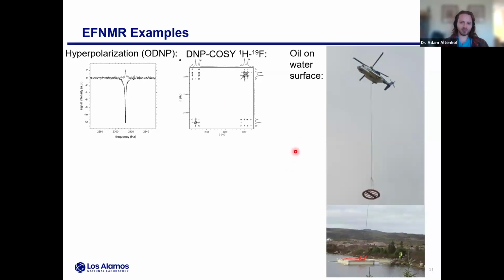This is from our friends down at ABQMR, just down the road in Albuquerque, New Mexico, Mark Conradi and Hilary Fabich. Some previous work they did. This is Earth's field NMR as done from a helicopter. Basically, they partnered with an oil company to see if they could detect oil on the surface of water. They did this in a very controlled manner on a lake. They have their coil set here, and power's running up to the helicopter, and this actually worked. They're able to measure the two different signals.